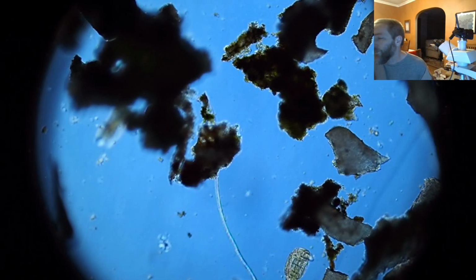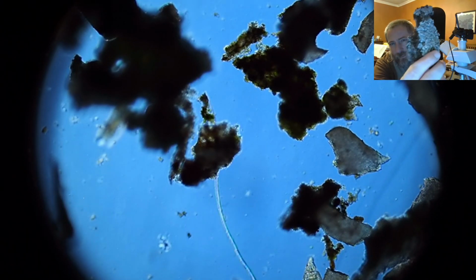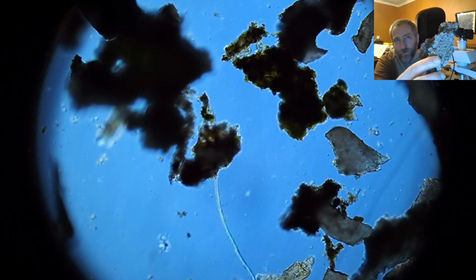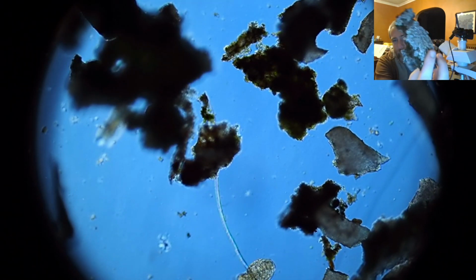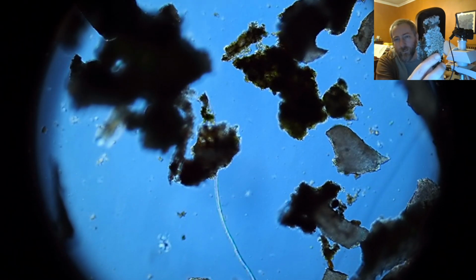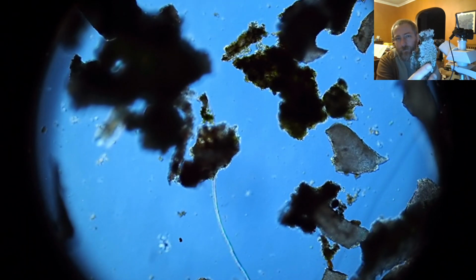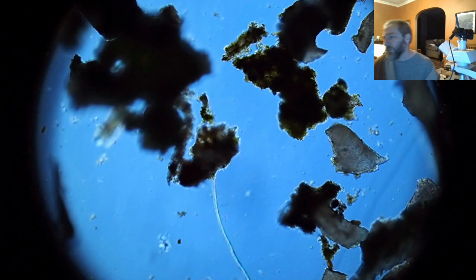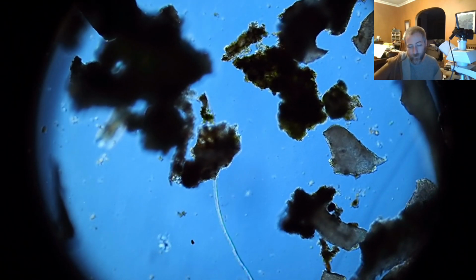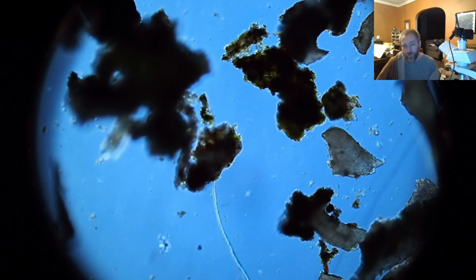And then I have this bark, but you can see there's a different kind of lichen on that altogether. It's a green, what do they call that, fruticose or something like that, lichen with blades on it. And it's clearly a mossy green color. And that's just an old piece of wood that was laying on the ground. I find that that's been the most effective way of finding them, is not to try to take them off a tree, but rather to try to get sticks.